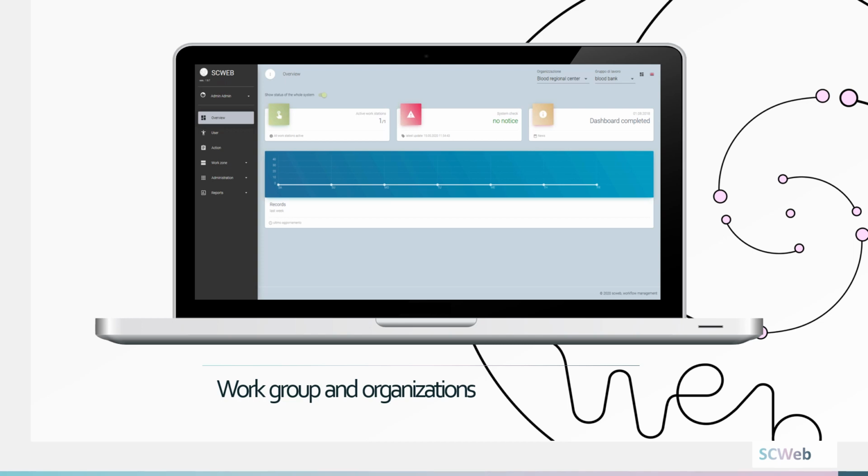In this presentation, we are going to explain the processes and traceability of the single actions carried out by healthcare workers when involved in the activities of collection, manipulation and storage of stem cells. But before we proceed, let us take a look at how groups and organizations are managed.